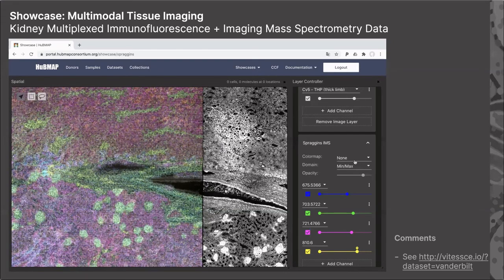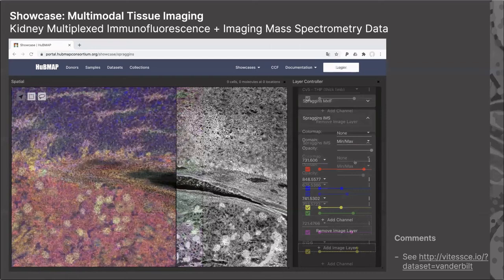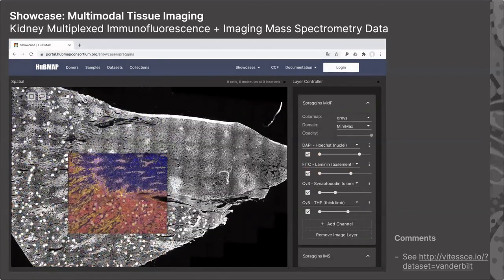At the moment, this is mostly to provide quick access to our imaging data, but you can do all sorts of things with this. As you can see, we can really change pretty much anything about how this information is displayed. And in the future, we will, of course, integrate these kinds of image data sets with, for example, cell segmentations and other quantitative data that's extracted from the imaging data. Ziv alluded to that earlier, and what can be done once we set up the analysis pipelines for that.